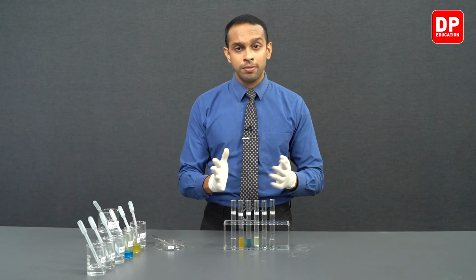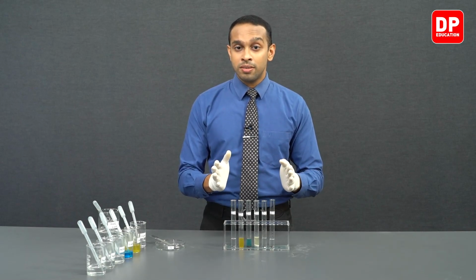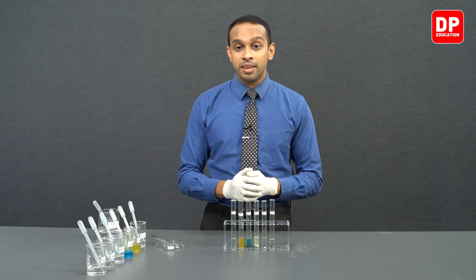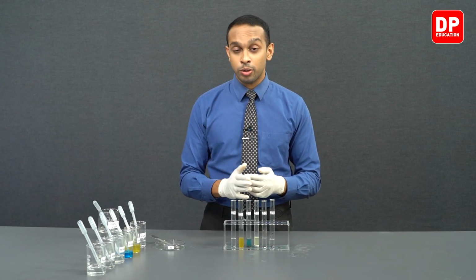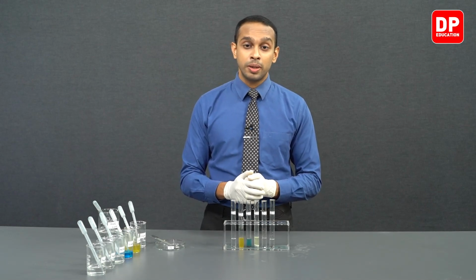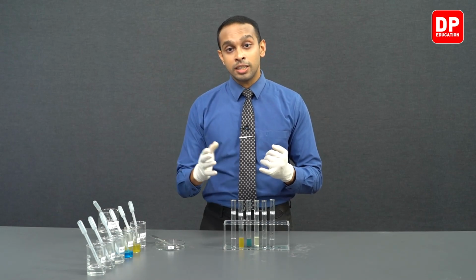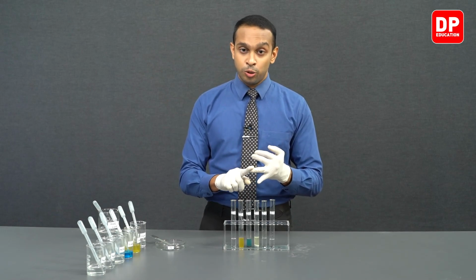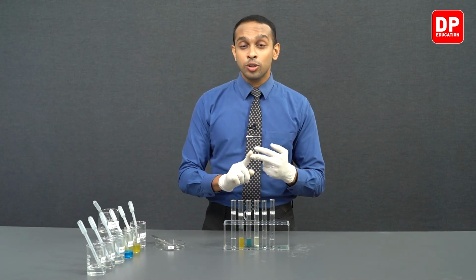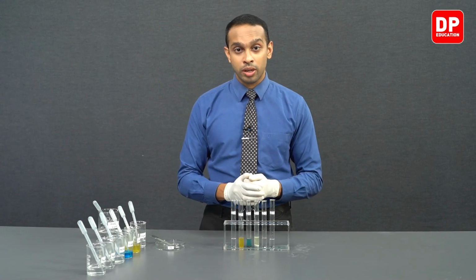Out of these 5 different aqueous ion solutions, we observed zinc was able to displace only a few: ferrous ions as iron solid, Pb2+ ions as lead solid, and cupric ions or Cu2+ ions as copper solid.